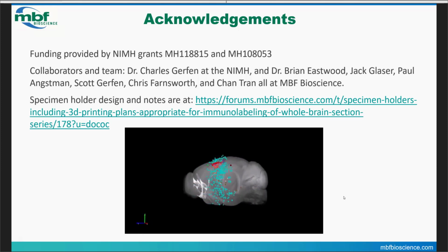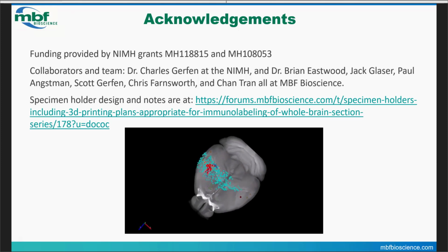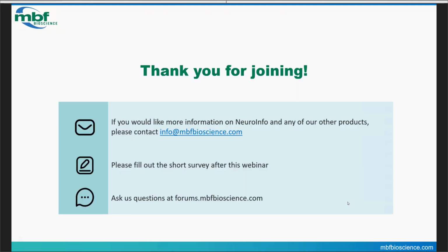When there are areas that would require imaging at higher resolution, what I typically do is a whole brain imaging at 10x, and then on those specific regions, we're doing a project now looking at the superior colliculus, I would use a 20x objective reconstructions only through those parts of the brain that would require the higher magnification. And it's not to say we couldn't use confocal images. We could, but again, these have all been done with just epifluorescent wide field fluorescent microscopy.